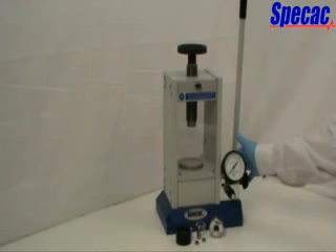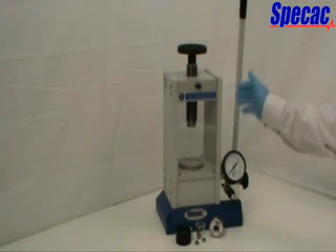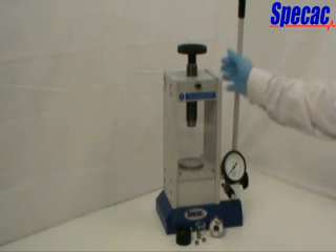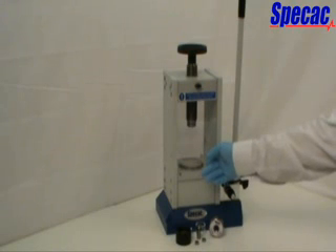The press consists of a pump block assembly, where the oil is pressurised by the simple pumping action from a handle, and the sample pressing side where the pressurised oil is forced to raise the piston assembly.